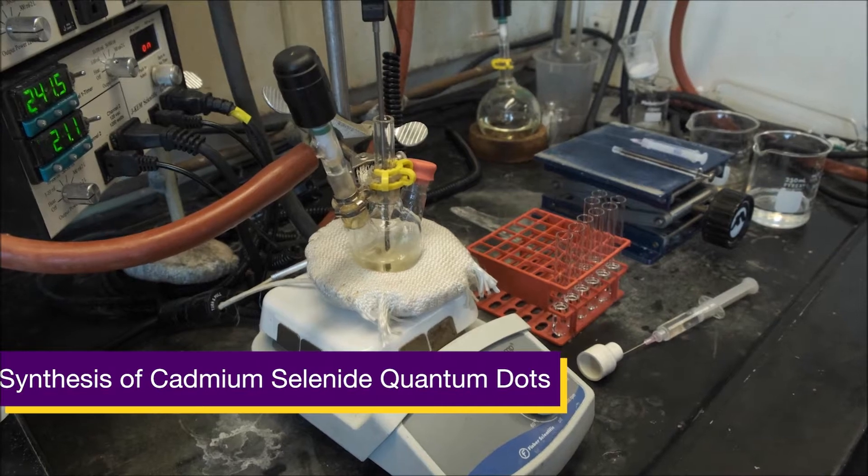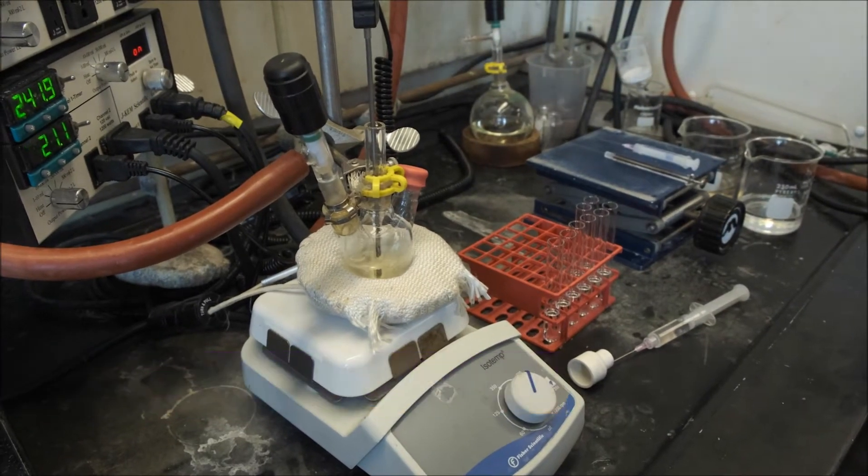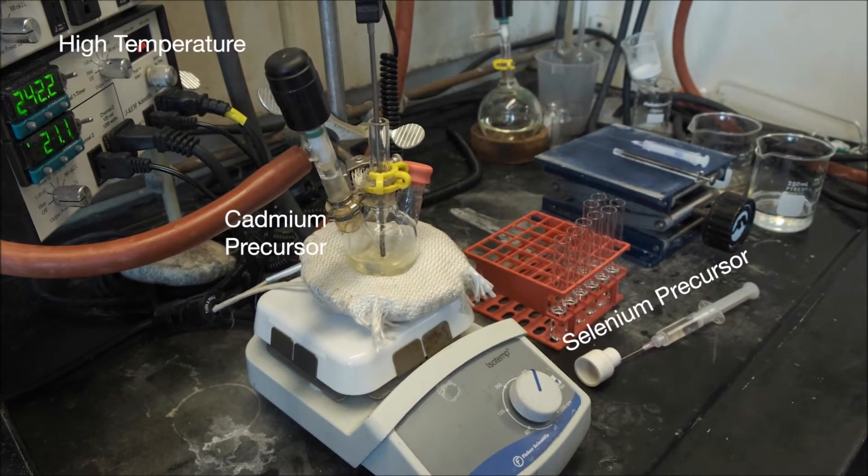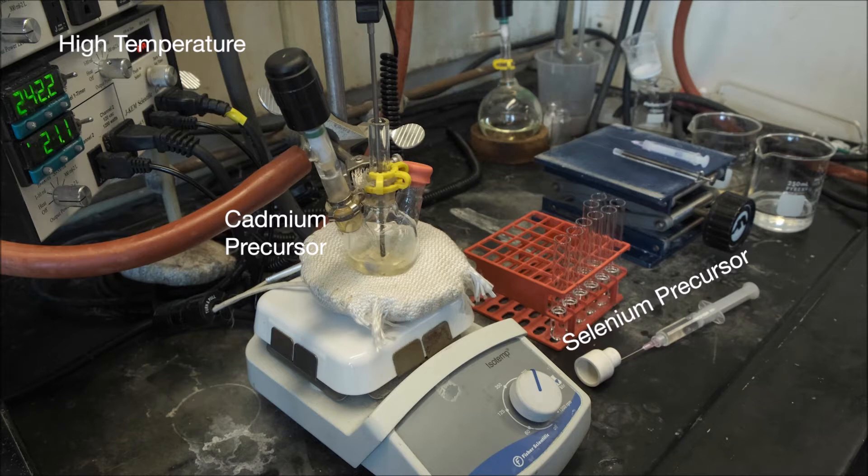Here we have a standard setup for the synthesis of cadmium selenide quantum dots. The key components are the cadmium precursor dissolved in solvent in the flask and the selenium precursor in the syringe. We're operating at a high temperature of about 240 degrees Celsius.